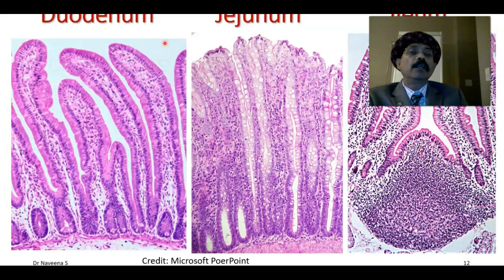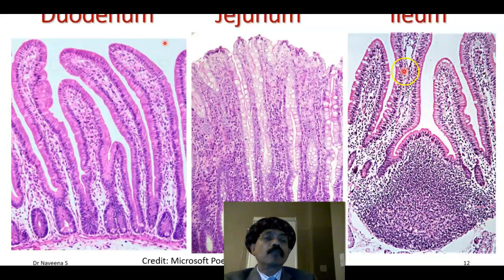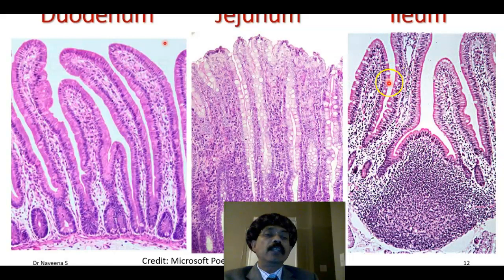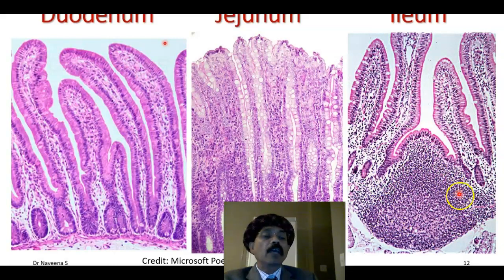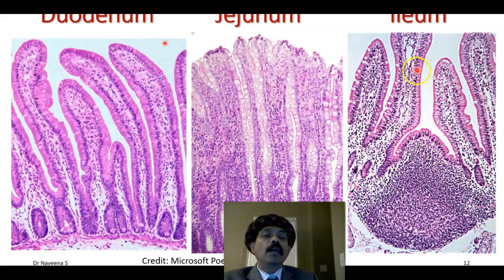And here in the ileum, the shortest of all villi, and there are many goblet cells — these light-stained areas are the goblet cells, also present in the jejunum, but by convention they should be more in the ileum. This is the lymphatic nodule present in the lamina propria, extending up to the submucosa, with a germinal center — the light area here. The lining epithelium is simple columnar epithelium, and the villi contain the lamina propria.